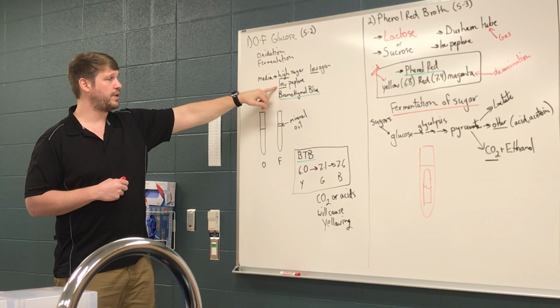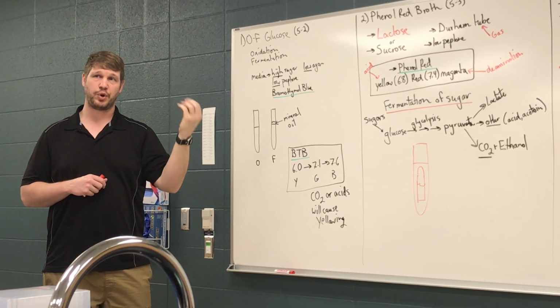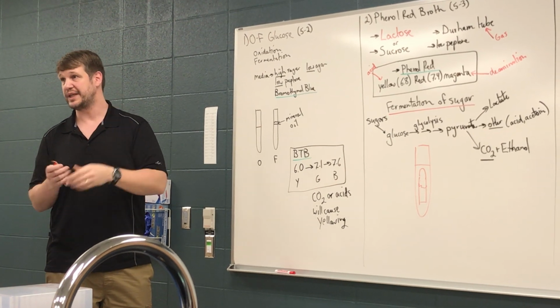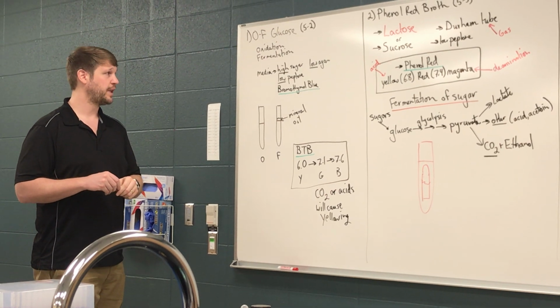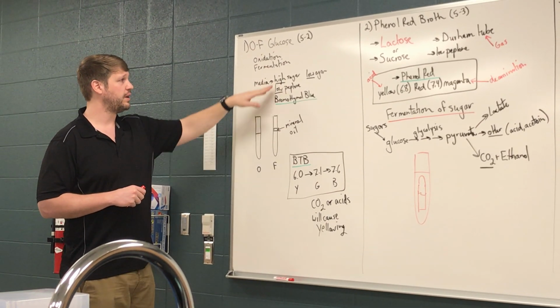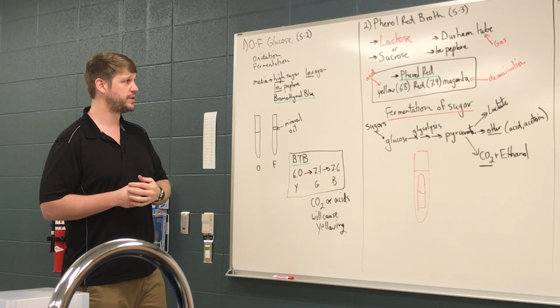It has a very low peptone, and I guess I probably talked about it before, but just to clarify again, peptone is a digest of a protein substrate of some sort. So it's taking pepsin and digesting meat, usually, some sort of beef byproduct. So this would be a source of amino acids and things like that. So there's very low peptone in here, high sugar content because we want them to be preferentially utilizing the sugar if they're capable of doing so.